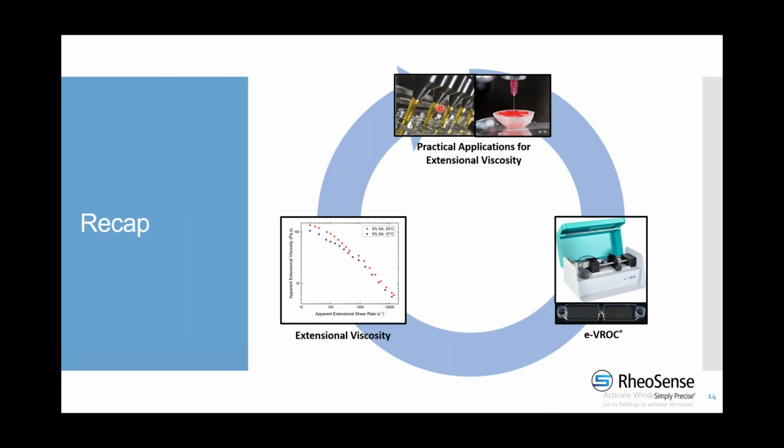Thank you, Soha. So here we informed you of all the practical applications of extensional viscosity that we showed for these scenarios. The applications focused on the filling process and the bioink 3D printing techniques. It's important to understand the extensional viscosity if you want to optimize these kinds of processes, including their formulations, so that you can get a higher throughput, higher quality, and other parameters that you want to get.